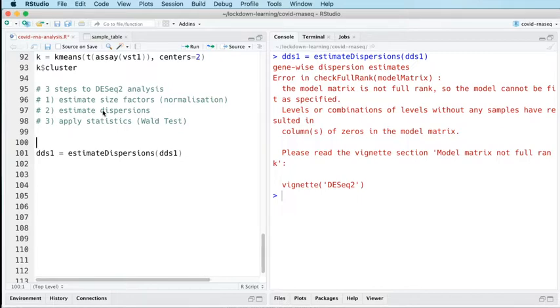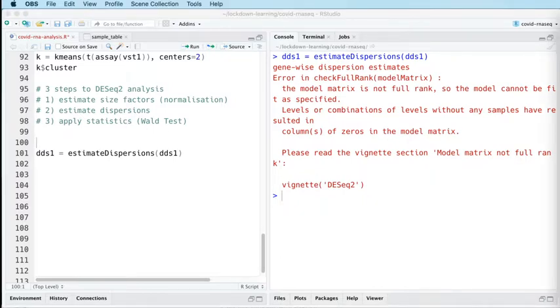Okay, so this is real bioinformatics, right? This is what happens when you're doing bioinformatics in real life, where you've not run this before because you've not encountered this data before. And as I've said all the way along, I've not always done these things before because I don't always have time during the day to prepare fully for that afternoon's lessons.